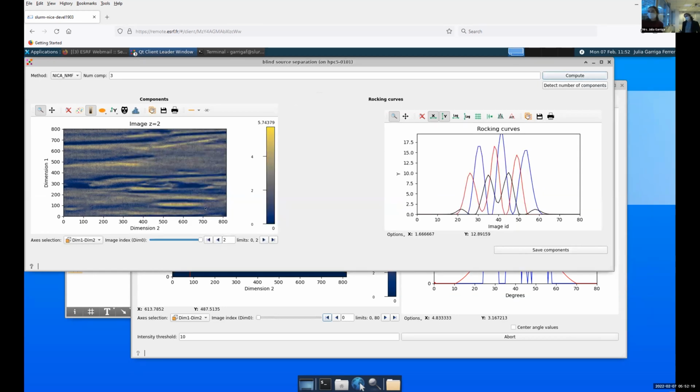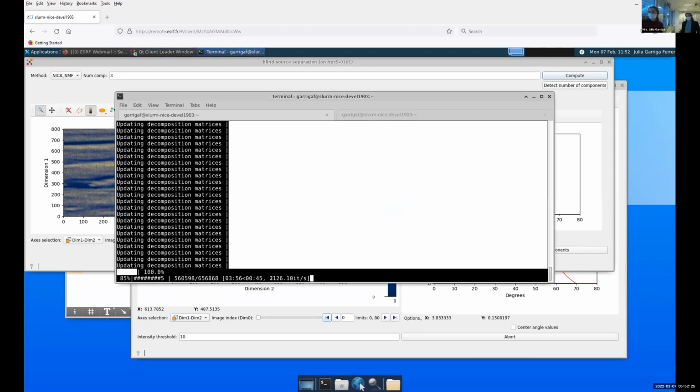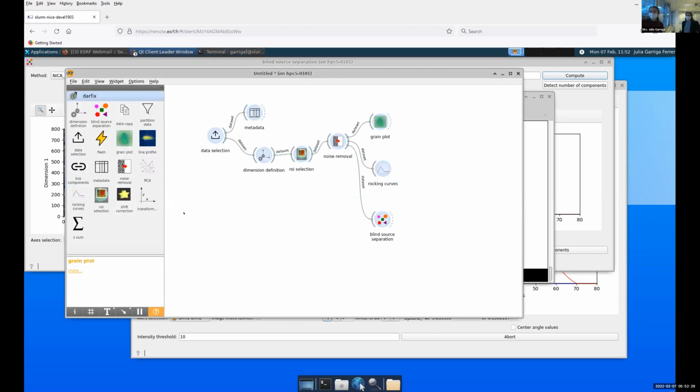Okay, so I think for this we are finished. I will see. Okay, here we have maybe 40 seconds left. I go back here and I don't know if I can explain a bit some of the others, maybe with the link components. Yes, so we can try something fun and input the components from the first dataset twice. We can do that, yes.